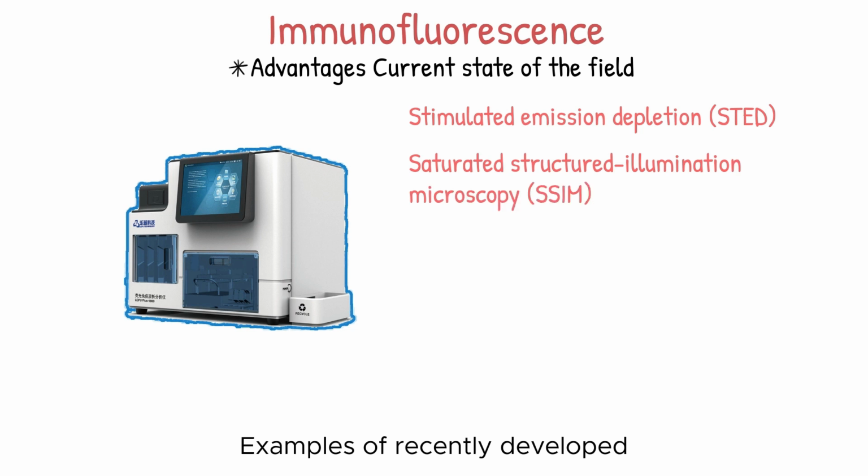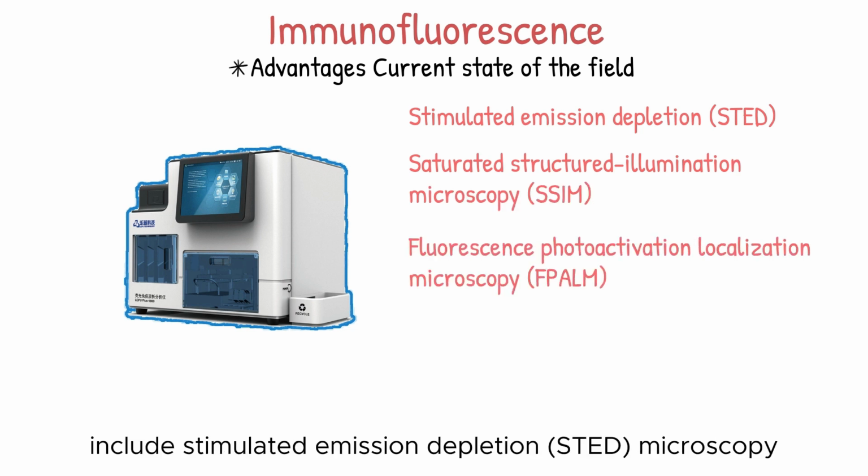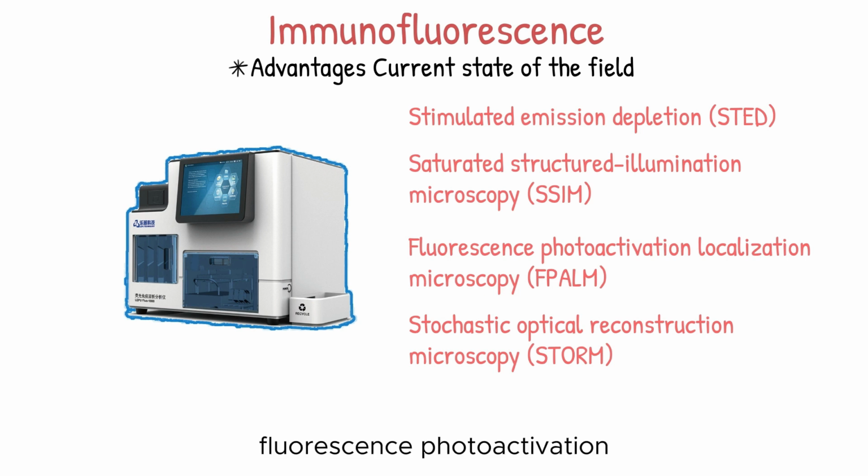Examples of recently developed super-resolution fluorescent microscope methods include stimulated emission depletion or STED microscopy, saturated structured illumination microscopy or SSIM, fluorescence photoactivation localization microscopy or FPALM, and stochastic optical reconstruction microscopy.